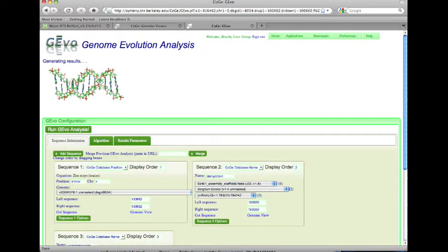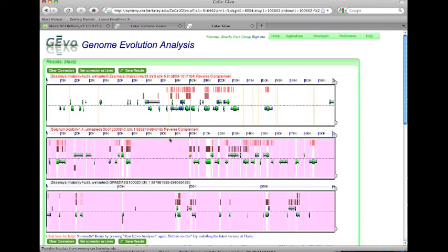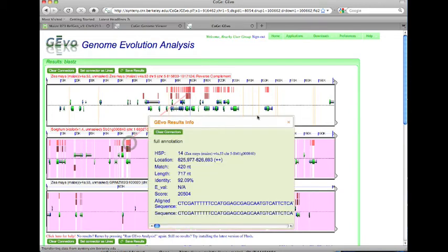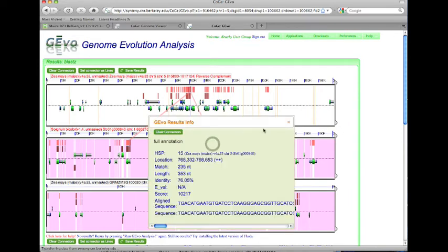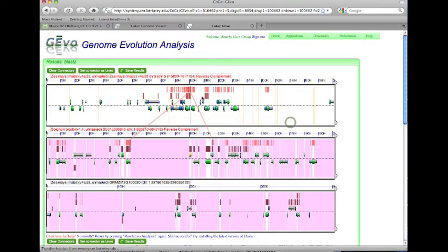What we're looking at here is what the new links that we'll be deploying in the next couple of days will be able to do, where they actually predict the region that a gene is expected to be found in. In this case we're looking at the yellow gene, which is conserved in one maize region as well as in sorghum and not the other. If you look at the BLAST hits from this region, they go up to this gene, and you can click, here's the last one on that end. And then there's this big gap of sequences that don't hit, and then there's only part of this gene. And you can see that these genes match up almost exactly against each other.